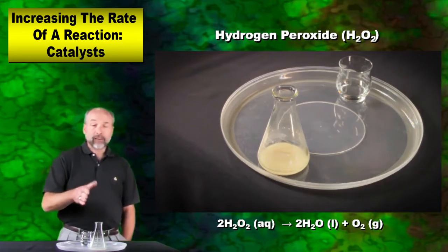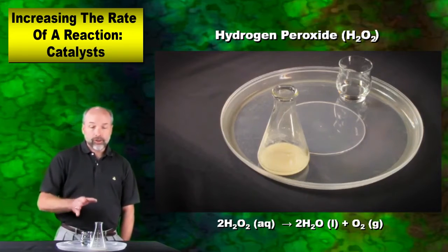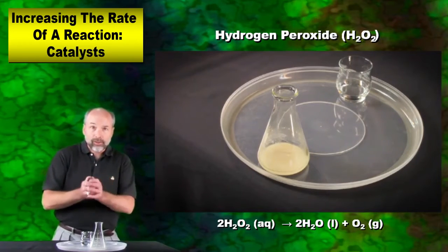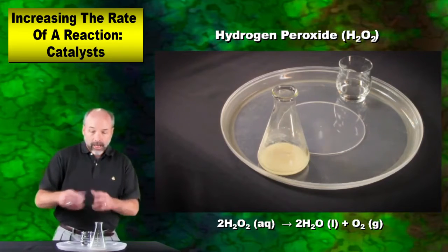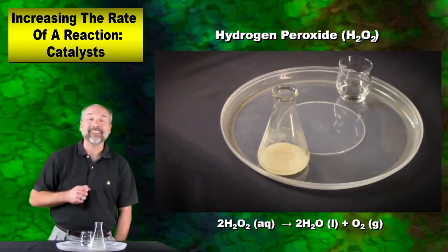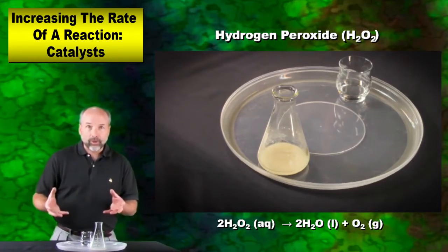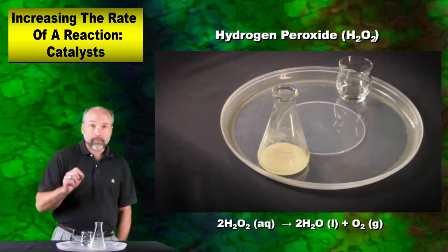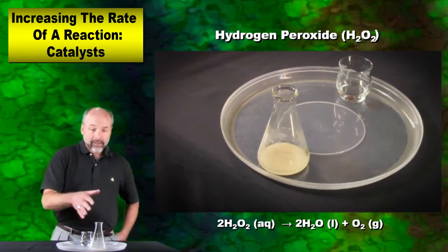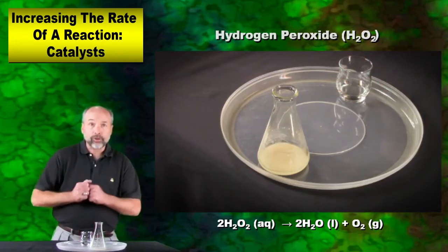Now, the catalyst I have before me is actually yeast, baker's yeast. And you could do this reaction one of 2 ways. You could take the yeast just as the little spores that you have inside of the little container and put that right in here, or take this and put it in there, whatever direction you want to go. But keep in mind, if it's a solid, the surface area is going to play a role. So what I did instead was simply take the baker's yeast and put it into solution. So now we've got a catalyst that's in this aqueous solution. Here we've got this liquid hydrogen peroxide.